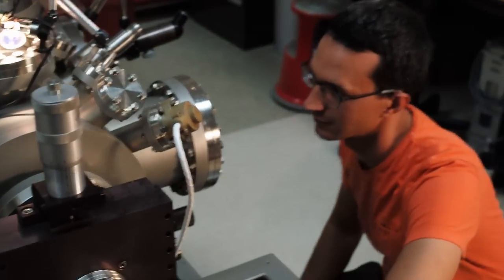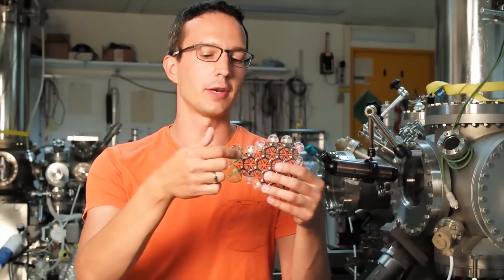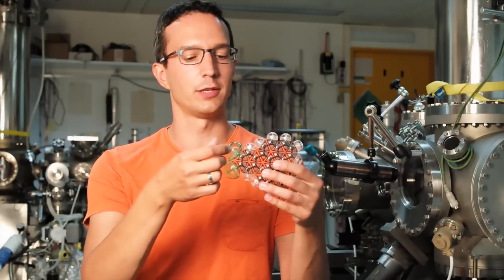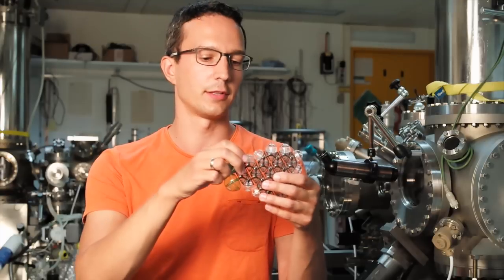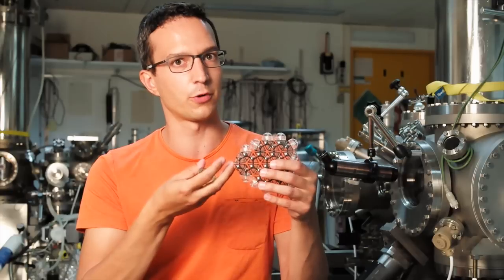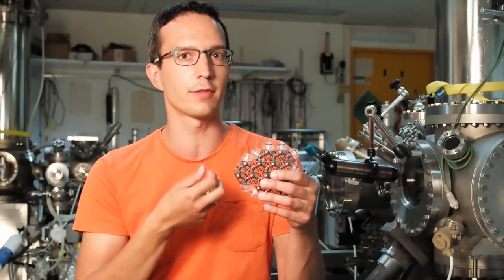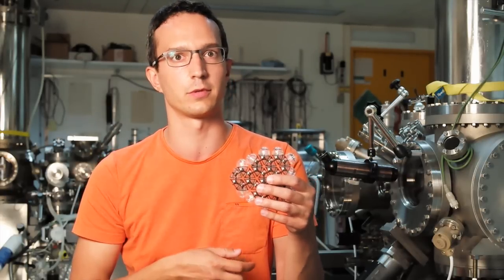IBM scientist Niko Pavlicek explains the technique. We have this precursor molecule, which is a hydrocarbon with two iodine atoms at its end. And the carbon-iodine bonds establish predetermined breaking points within the molecule that we can break with our microscope tip. And to stabilize the generated highly reactive arine molecules, we have to perform the experiments on an ultra-thin insulating film and the temperatures close to absolute zero.